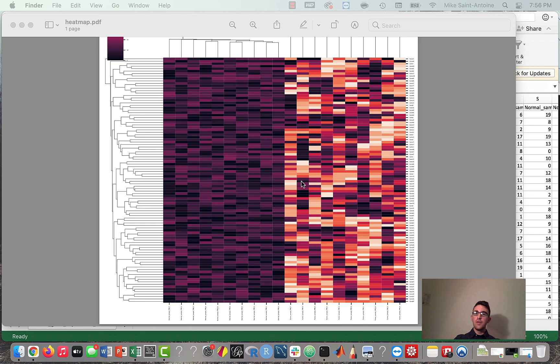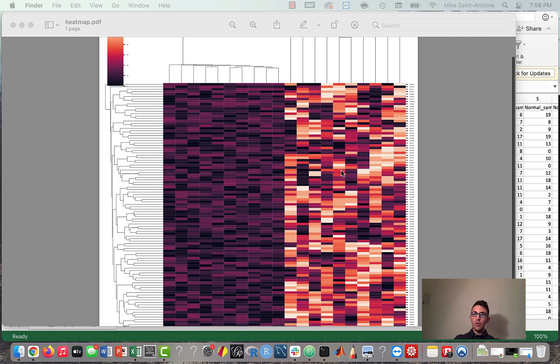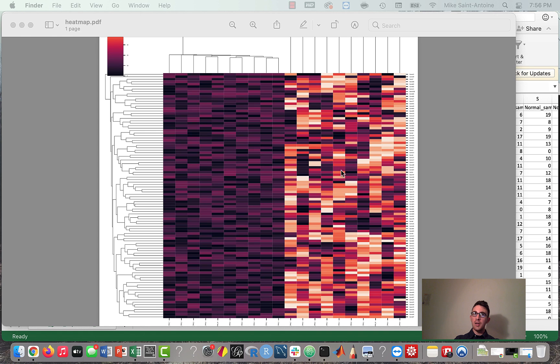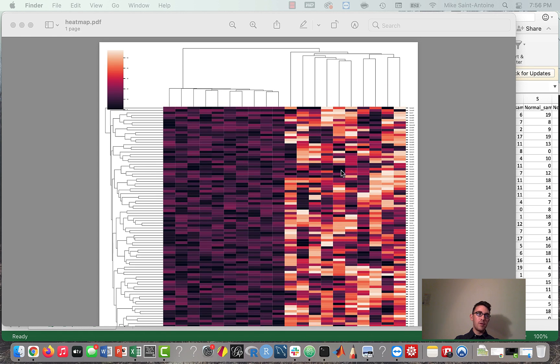Hi everyone, thanks for checking out this video. This is going to be a lesson about how to make a gene expression heat map plot using Python. If any of you are going to school for bioinformatics or pursuing a bioinformatics career, this is going to be one of the most common types of plots that you run into. It's very useful to include in a paper because it's really good for getting the point across when it comes to RNA-seq analyses or other types of gene expression analyses.